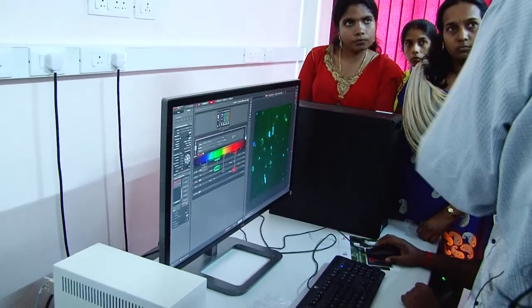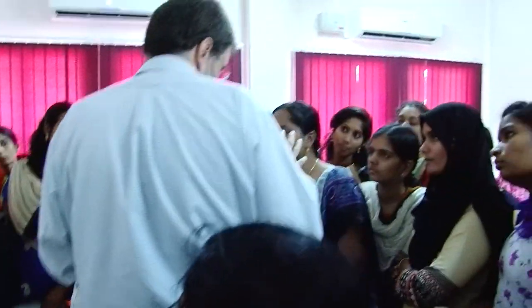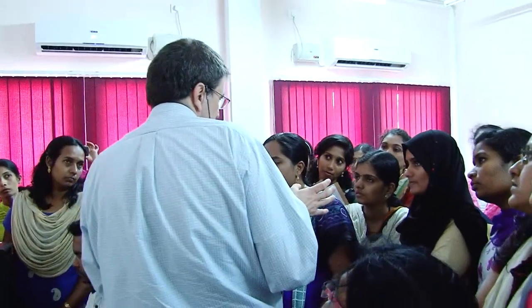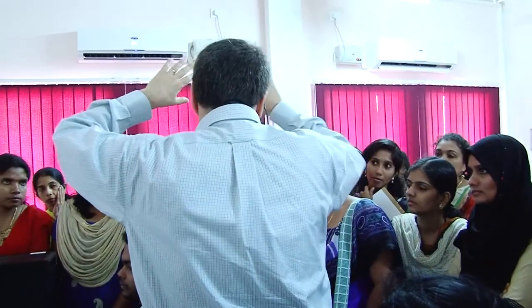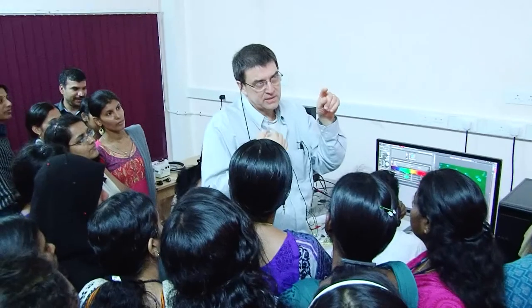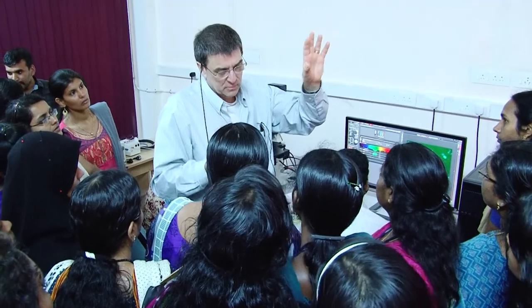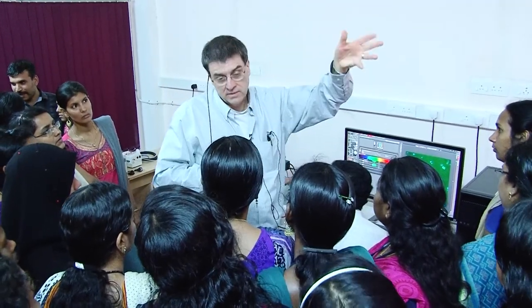But what we're going to do, so what can I do? We talked about it yesterday. To make the confocal image better, what can we do? Average. And you remember what averaging is? So what we're going to do is frame average. So it'll take a picture of that frame, it'll take a picture of that frame again, the third time, the fourth time. Now it's going to take longer, but the pixels that are the same in every frame, it's going to keep, whereas the pixels that only appear in one of the frames will get thrown out because that would be noise probably.